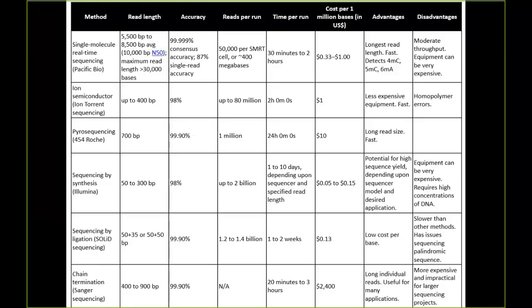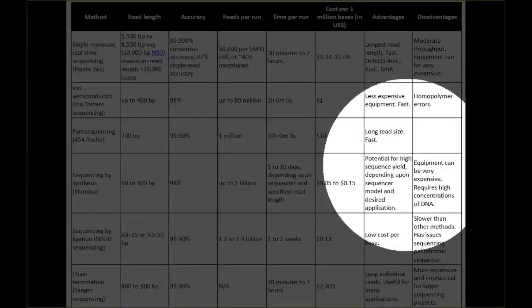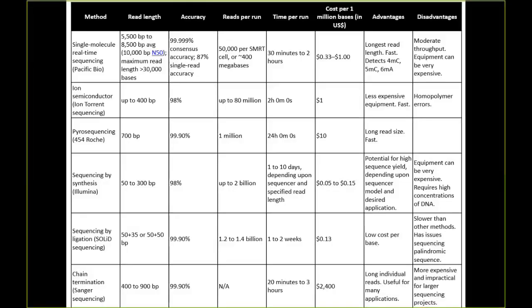Since this chart has been made, the technology has definitely evolved. So Illumina has the market captured. Somewhat unfortunate in some ways because probably the sequencing price hasn't come down as quickly as it would have otherwise. But to their credit, Illumina has done a good job of being very rigorous for their methods and making sure that their work is reproducible. Well, I do have questions about some of their business practices that might keep the prices a little bit higher than one would expect. It is nice that Illumina has pretty good quality control, and they are very thorough with their job.